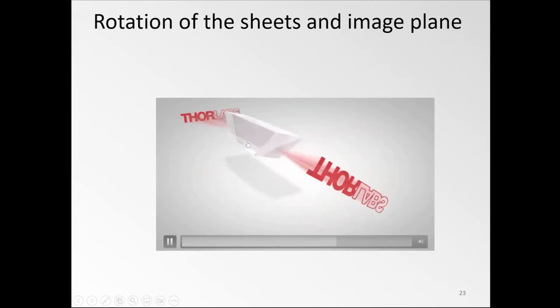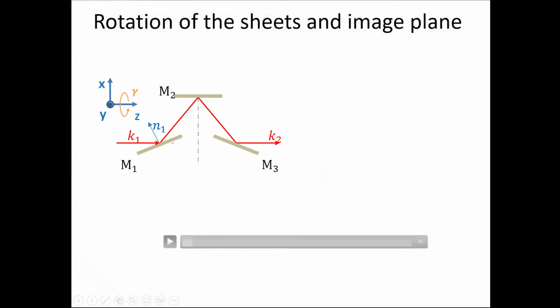You can get the same effect with a so-called K-mirror, my apologies, not K-space. This is an arrangement of mirrors, and it gets its name from this peculiar arrangement of the mirrors and how the beam path goes. So the light bounces off this first mirror, goes to the mirror on the top, bounces back and propagates again straight.